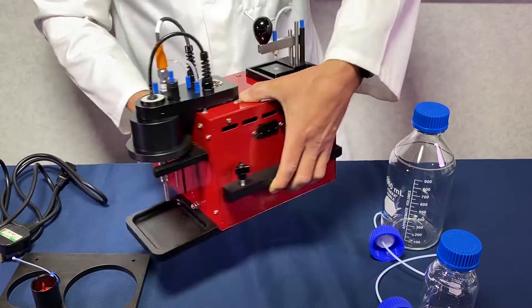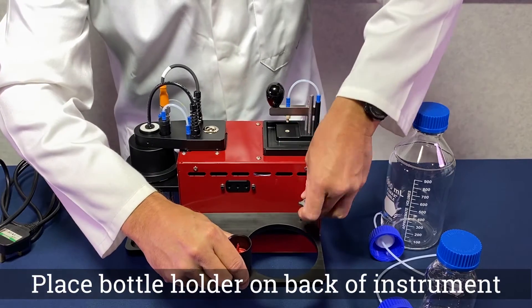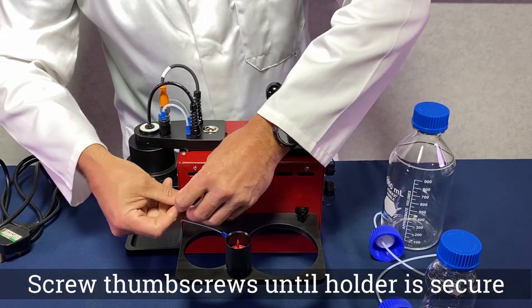Attach the bottle holder to the back of the WSI. Remove the thumb screws. Place the bottle holder on the stand support, ensuring the dyed water bottle holder is facing upwards, and secure with the thumb screws.